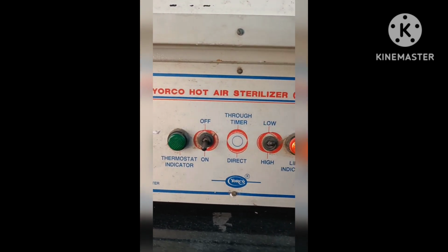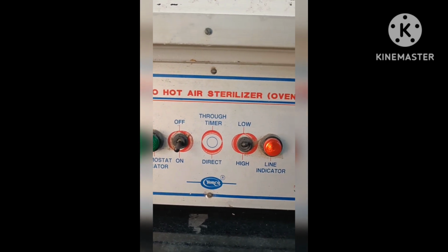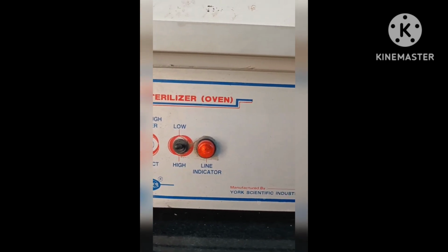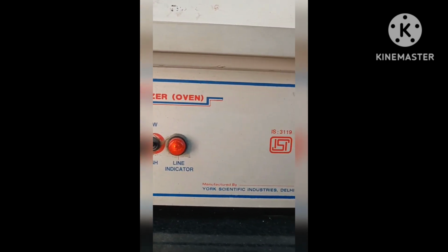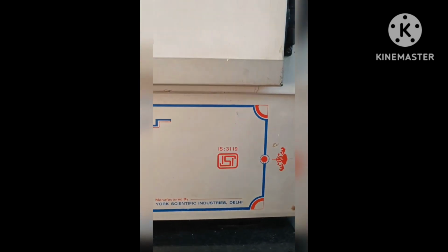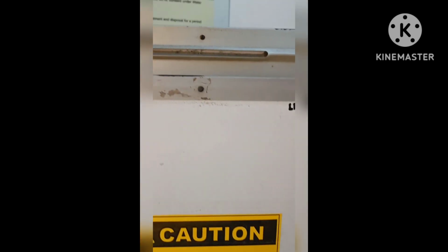A heater. With the passage of electric current through a conductor, heat is generated following the rise of temperature. The heating element has three main features: high resistance, electrical insulation, and high thermal conductivity. The different types of heater used in hot air oven are one side circular type heater, one side U type heater, one side wave type heater, one side square type heater, three sides type heater, and four side type heater. The heater operates at temperatures from 50 to 300 degrees Celsius.